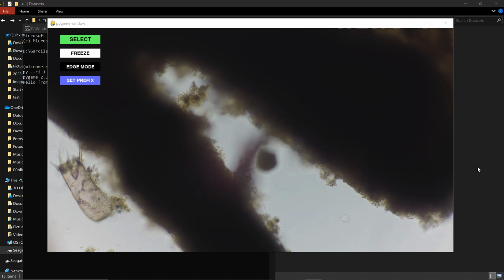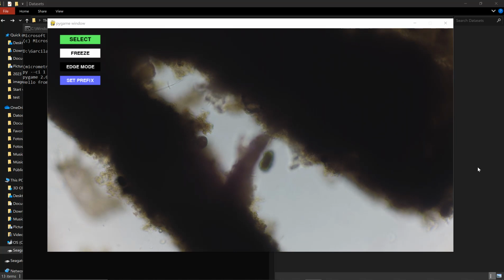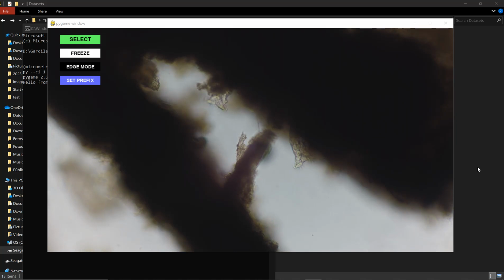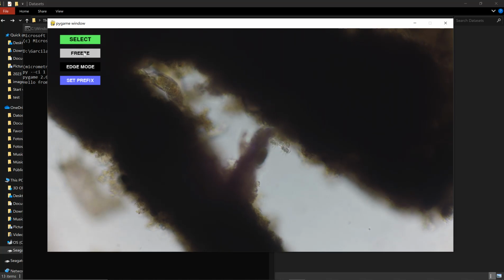Micrometry Datasets is a recent expansion that accounts for the necessity of creating datasets for machine learning implementations and has been recently added to the vanilla micrometry toolkit. The user interface remains simple, and its purpose is to subsample an area of the screen in order to save it with a respective label. Depending on the type of samples that we're using, we can freeze or unfreeze the views just as before.